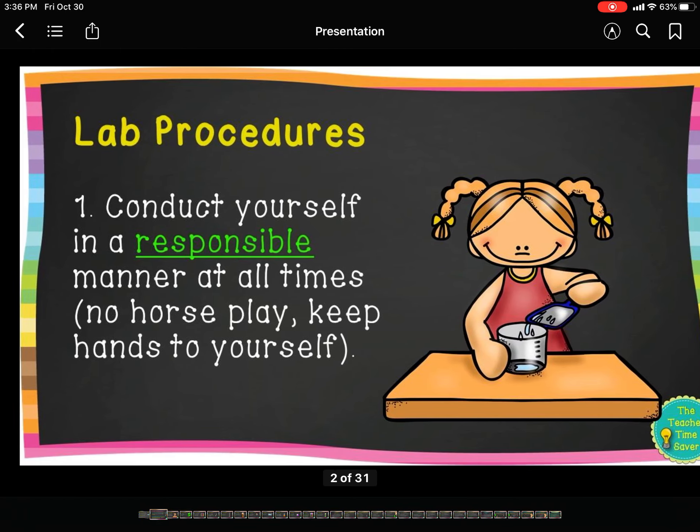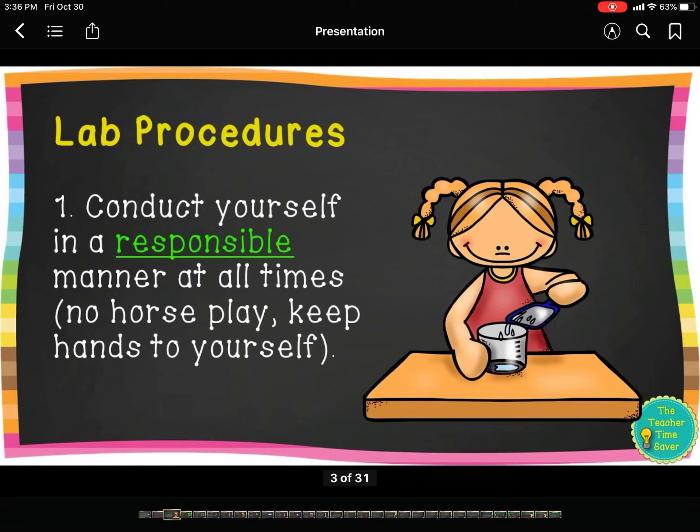Lab procedures means rules that you have to follow when you are in the lab or when you're doing an experiment. These are things that all scientists have to do, whether they're in a lab in middle school, high school, studying organic chemistry at a university, or building rocket fuel to go to Mars. All scientists follow these same procedures in order to stay safe, because labs can be dangerous.